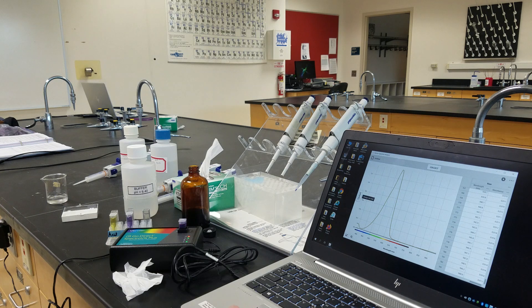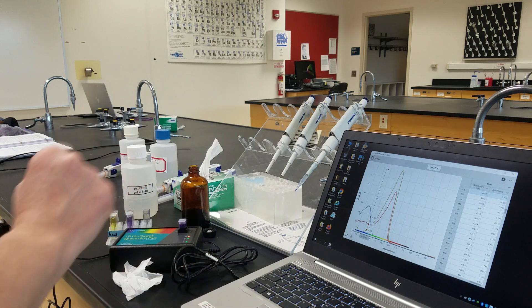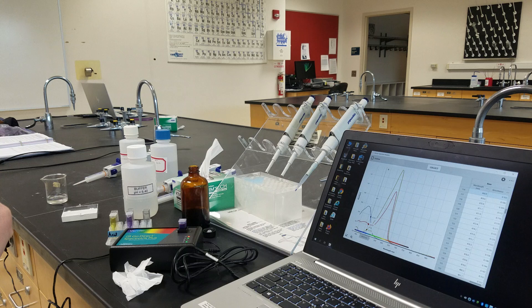Now we have the option to put all three of these spectra onto the same graph. We want to choose a point by sliding our cursor along — a point where all three of the indicators have a sufficient absorbance. We're going to use those three data points to do the calculations to figure out the pKa of our unknown indicator.